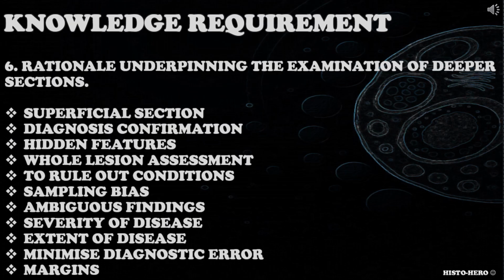When addressing this knowledge requirement, candidates should consider superficial sections that were not deep enough, deeper section to confirm diagnosis, to detect hidden features that might be deeper in the tissue, to assess the whole lesion, to rule out certain conditions, to minimize sampling bias, when the initial findings were ambiguous, to assess severity and extent of disease, to minimize diagnostic error, to expose all margins, and so on.